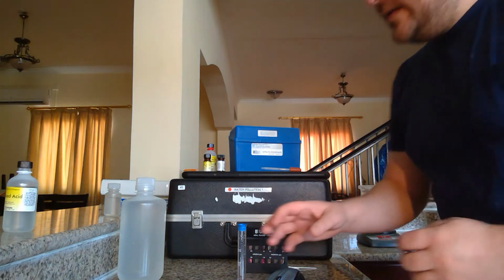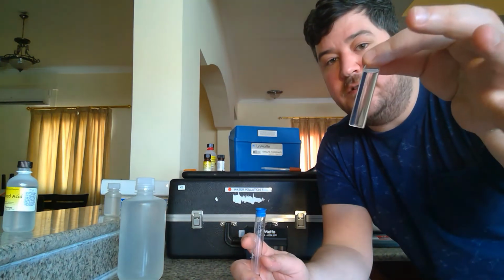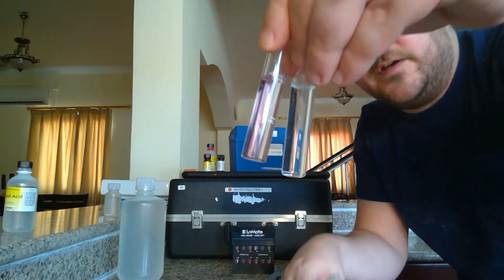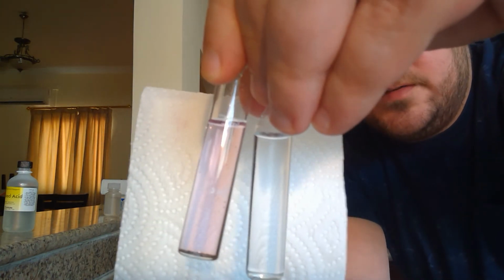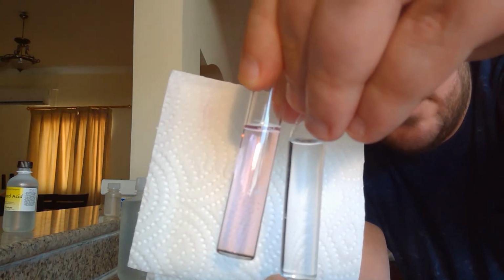Okay, so it's been 10 minutes. The sample has definitely changed color. The test kit comes with this standard to compare it to, and even without using the reader here, you can see the difference in colors if I hold them side by side, clear water and the sample water. The sample, you can tell, is clear but kind of pinkish, almost looks like the end point of a titration.